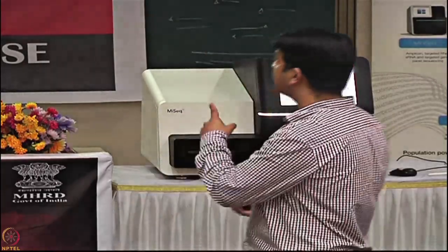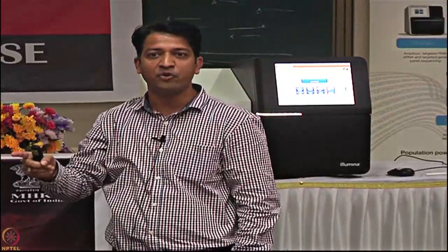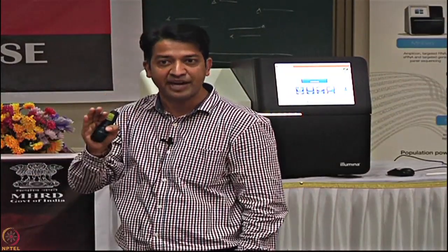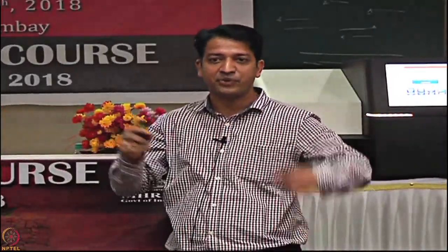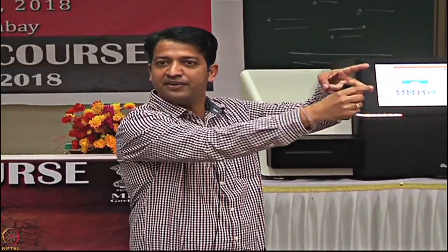So what exactly is paired end sequencing? Essentially, as you remember, initially we generate both fragments. If you wish to sequence only the forward strand, you cleave away the reverse strand and sequence only the forward strand. In paired end sequencing, you regenerate both strands. The second time, you retain the reverse strand and cleave away the forward strand. In this manner, you can sequence both stretches of DNA, one forward and one reverse.